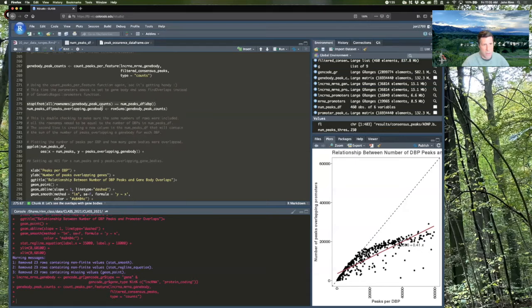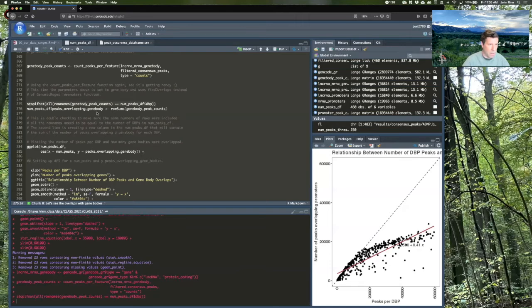So we should expect an account of entry the same length for gene body counts as for promoter counts, because there's only one associated with each gene. There are ways that that could have been mistaken, and then that would be a big problem. So this is just making sure that's not an issue, and if it's not, we can keep going.